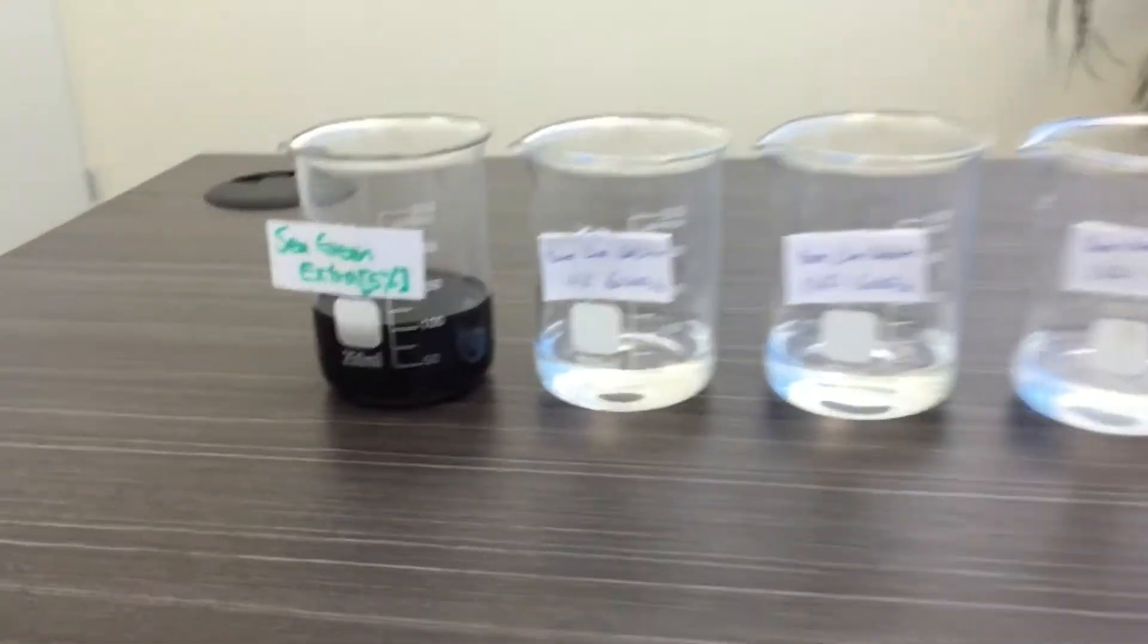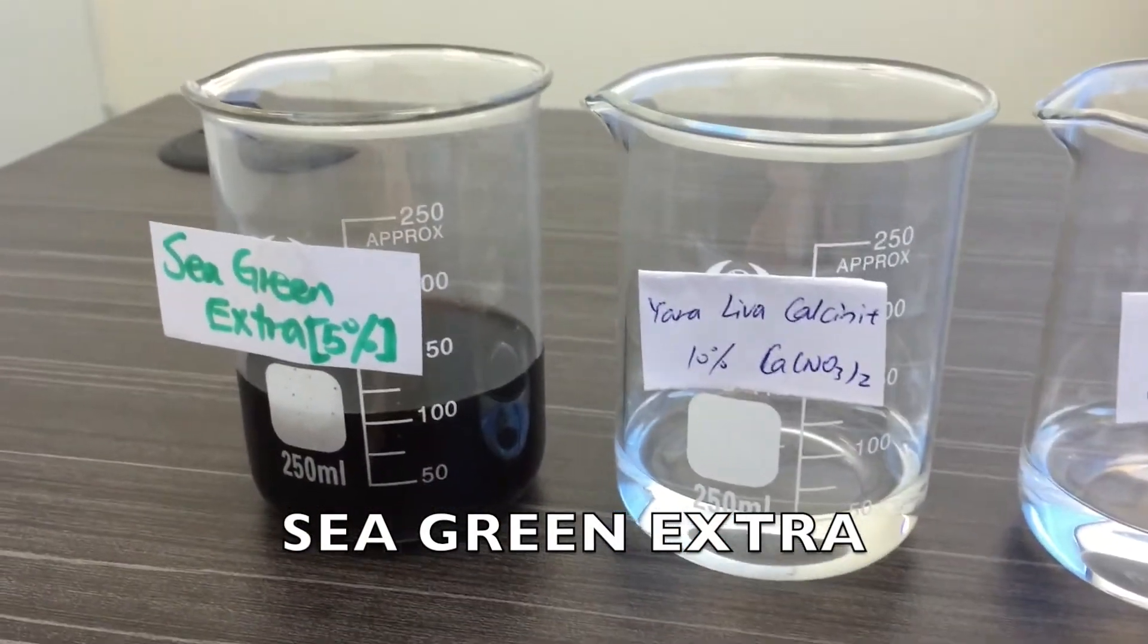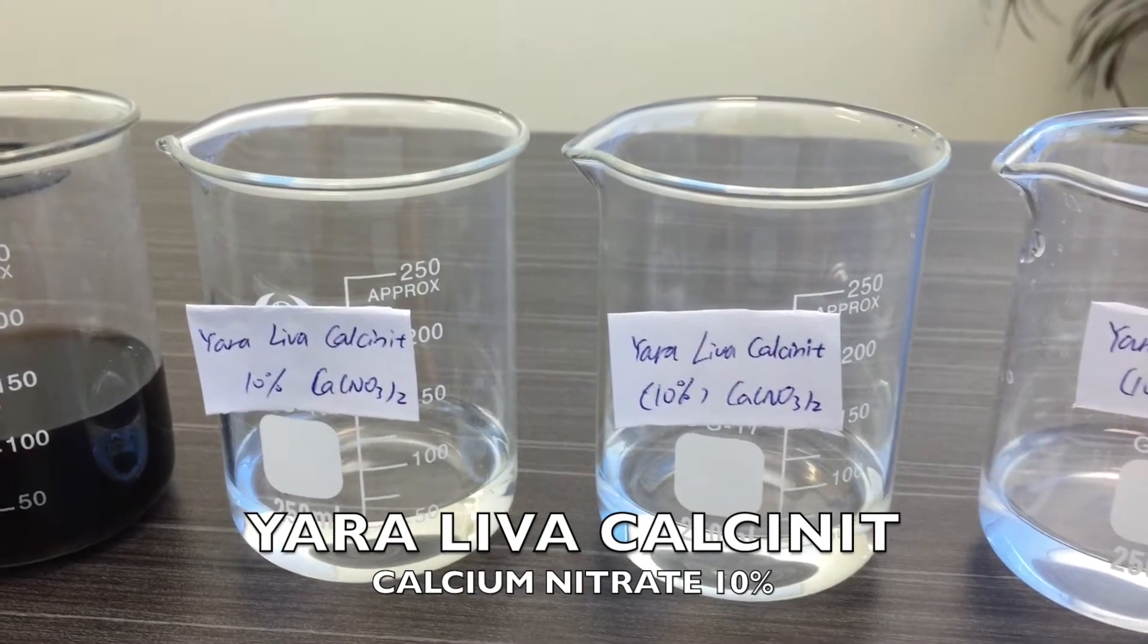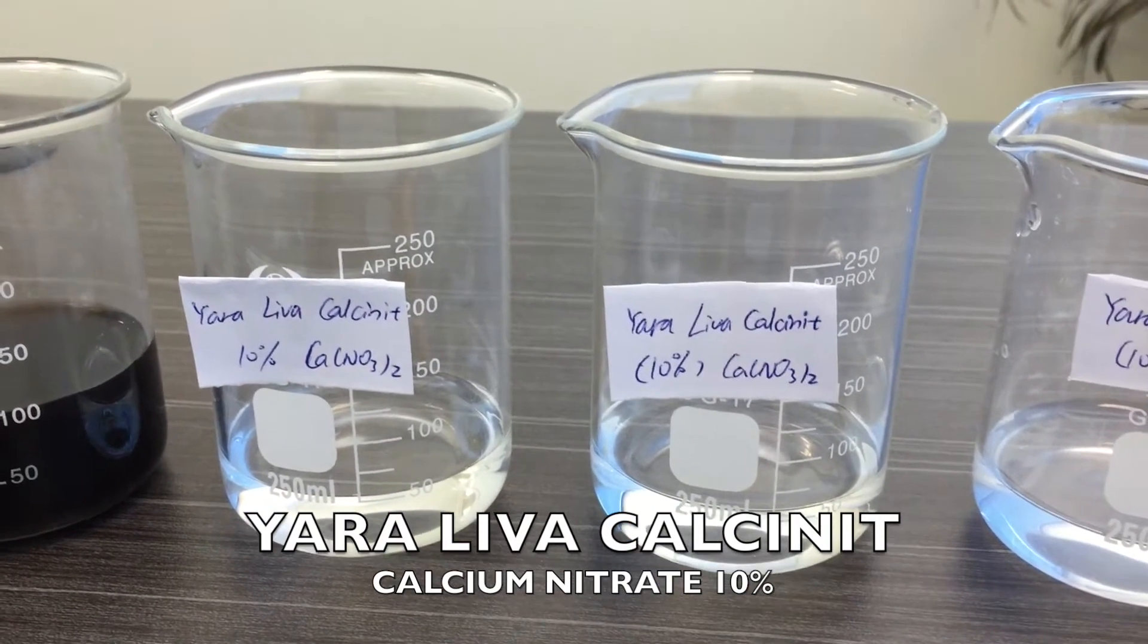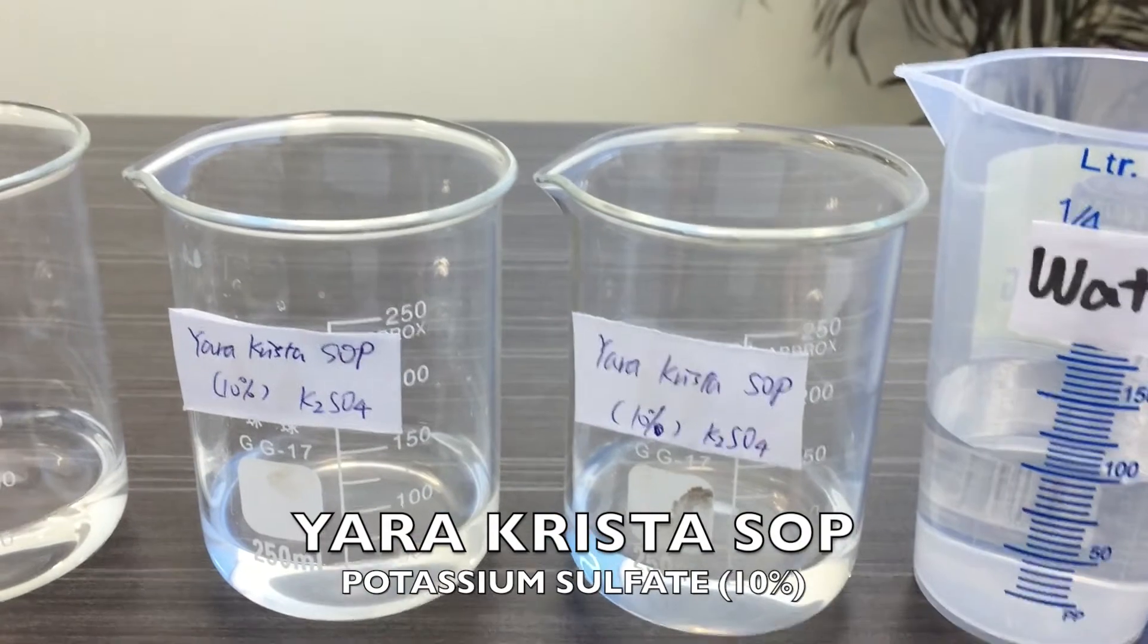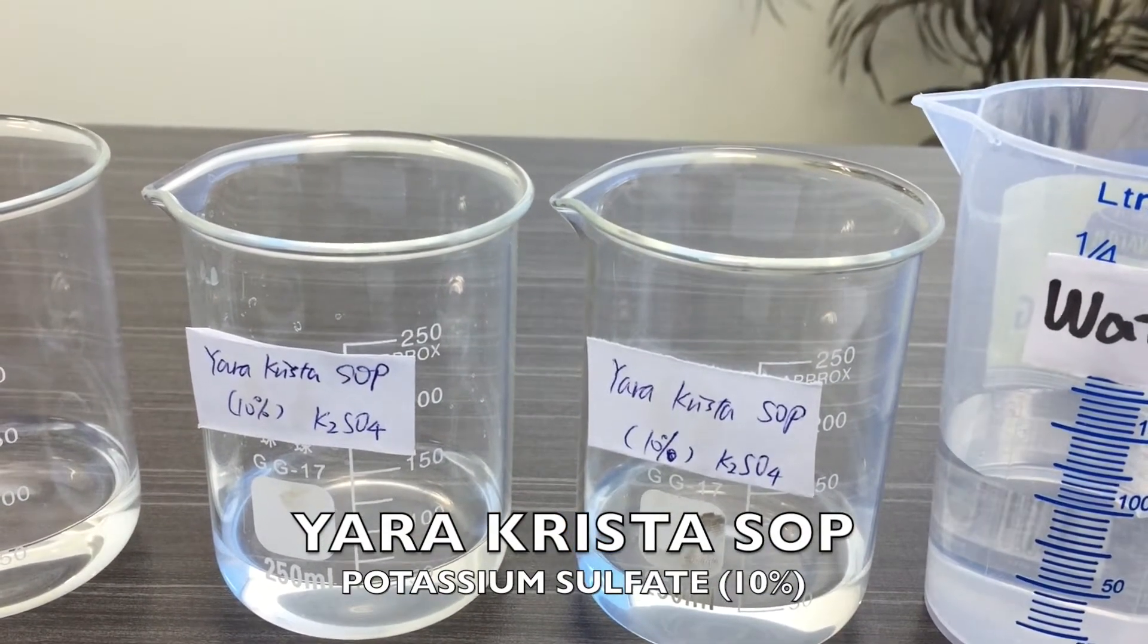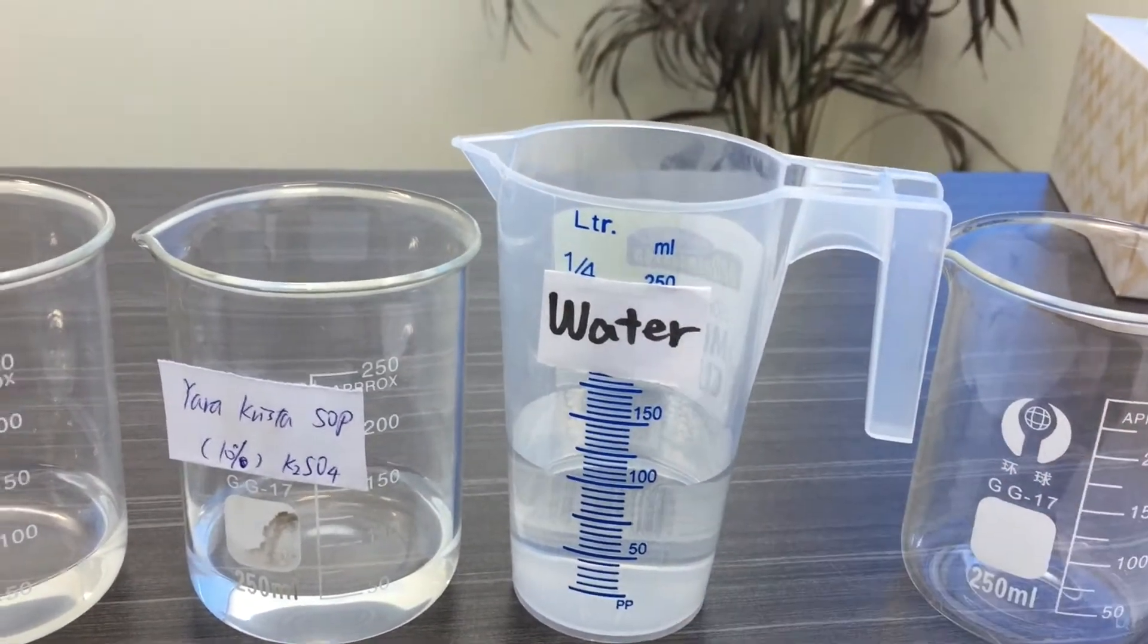Over here I've got six solutions. The first one is Sea Green Extract solution. In this beaker is Yara Liva Calcinit with a concentration of 10% calcium nitrate. In this beaker I've got Yara Crystal SOP with a concentration of 10% potassium sulfate solution. And over here I've got 100 ml of clear water.